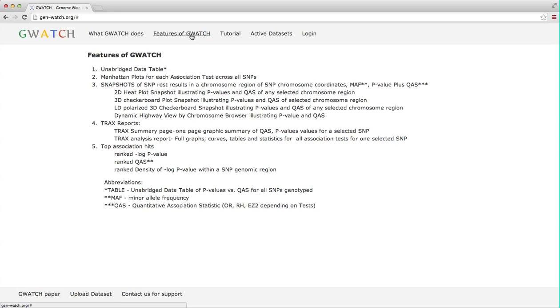A detailed 10-plus page TRAX report for any SNP showing unabridged curves, graphs and tables for all gene-disease association tests. Finally, an automatically generated list of strongest association hits based on extreme p-values, QAS or density of p-value signals in a chromosomal region.